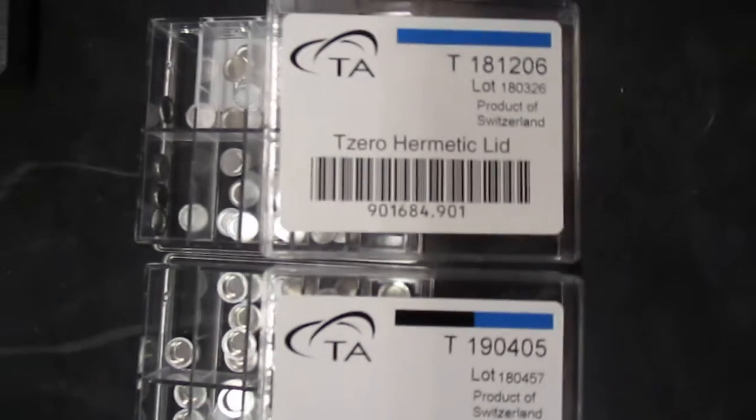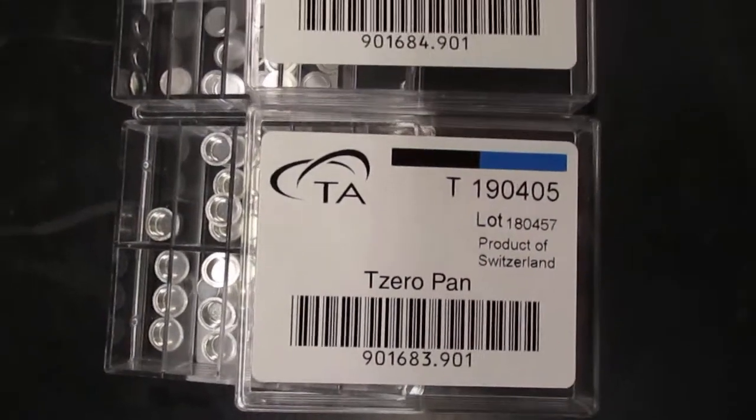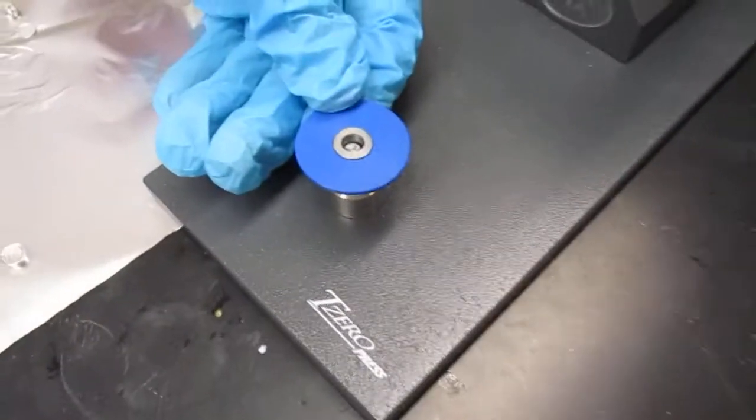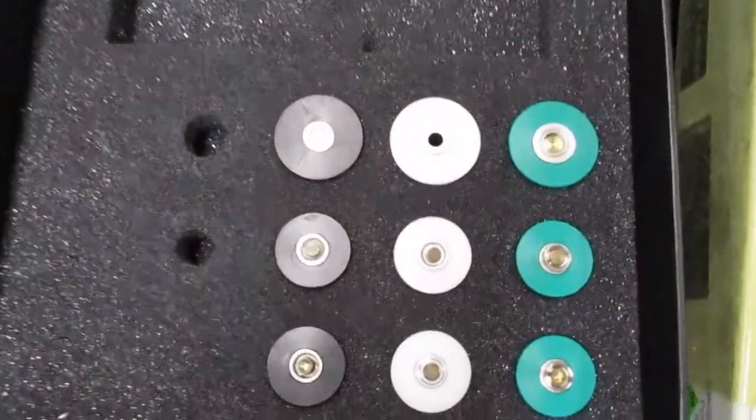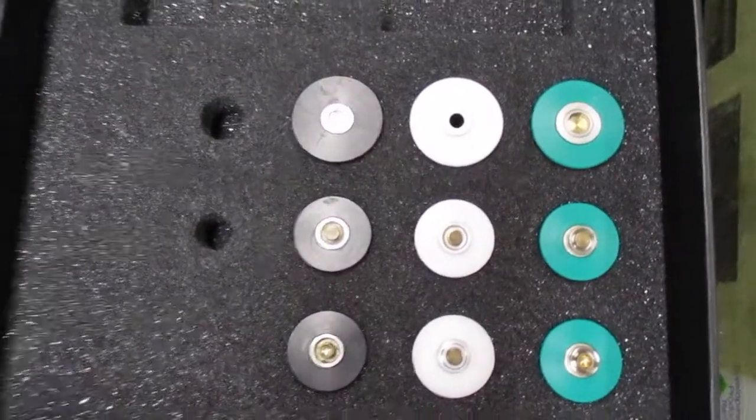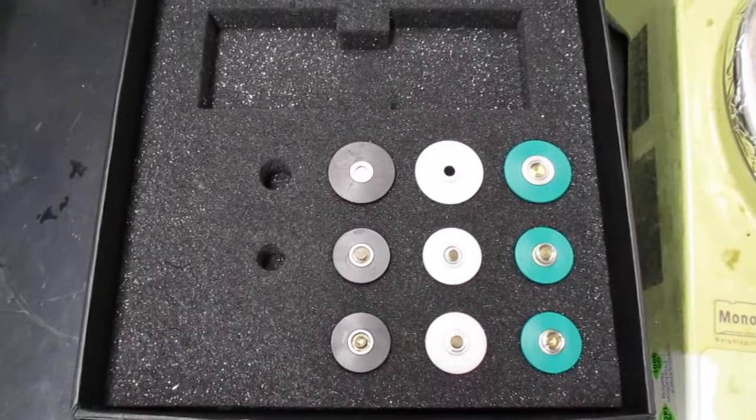For today we are using the T0 Hermetic pans and lids, and for this size we have to use these blue platforms which has a cap that is on the press already right there. Now if you have different types or different sizes of pans and lids, you're going to need to use these different colored caps accordingly which correspond to different sizes of pans and lids.